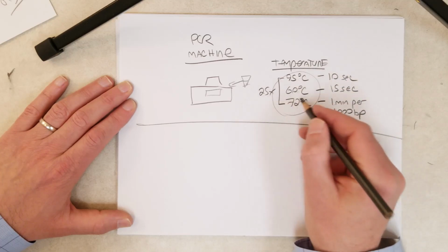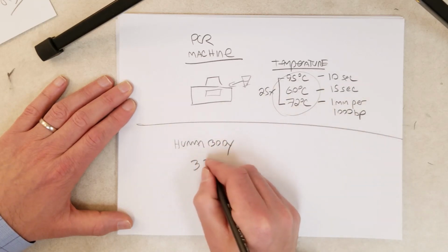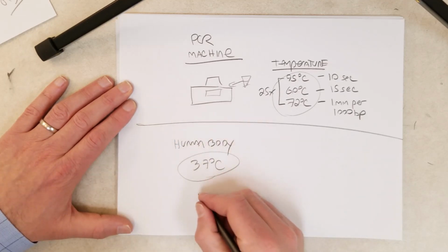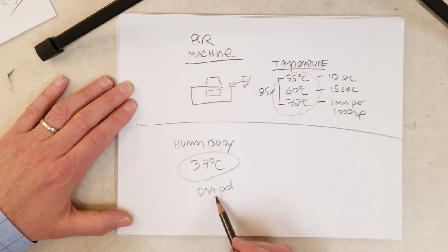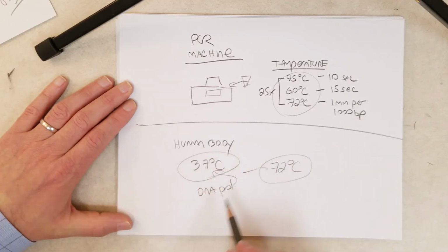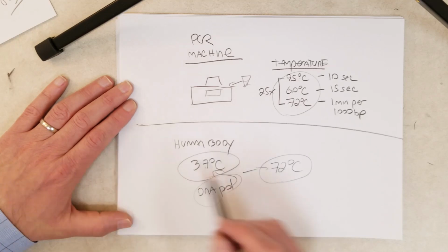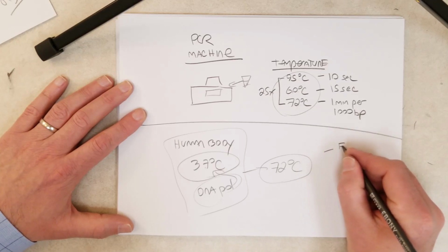Last thing here, notice these temperatures. Those are pretty high, right? Human cells are what, close to 37 degrees Celsius? So you can bet our DNA polymerases work well at 37 degrees Celsius. Eukaryotes have a couple of different DNA polymerases. If we try to use our DNA polymerase at 72 degrees Celsius, the DNA polymerase would probably denature. When you talk about proteins denaturing, that just means their structure comes apart. They won't function.